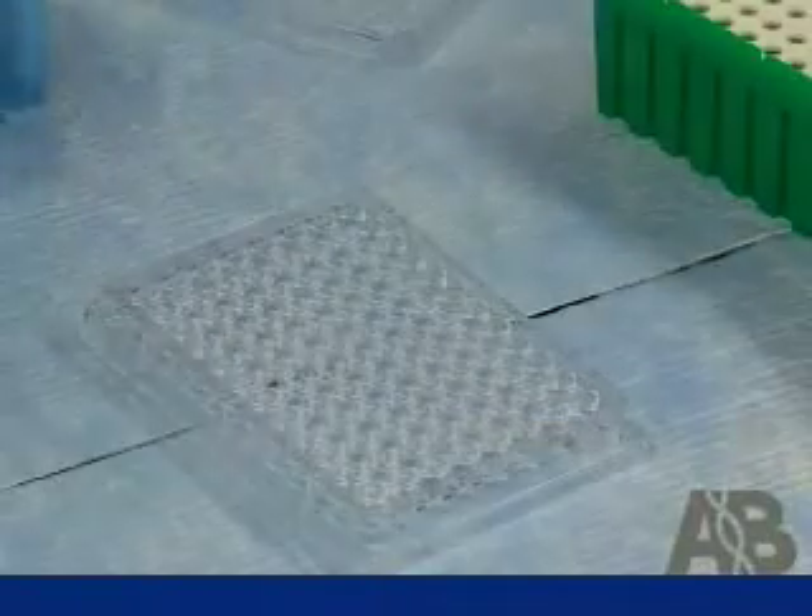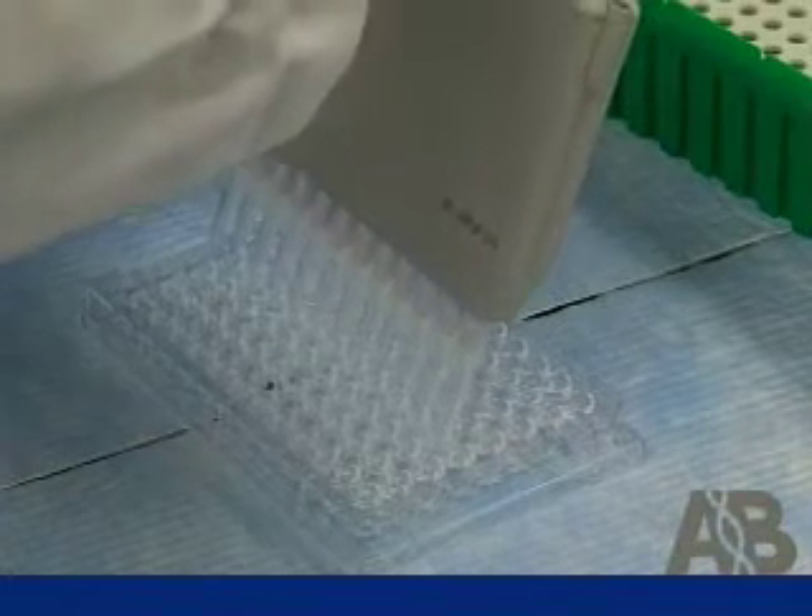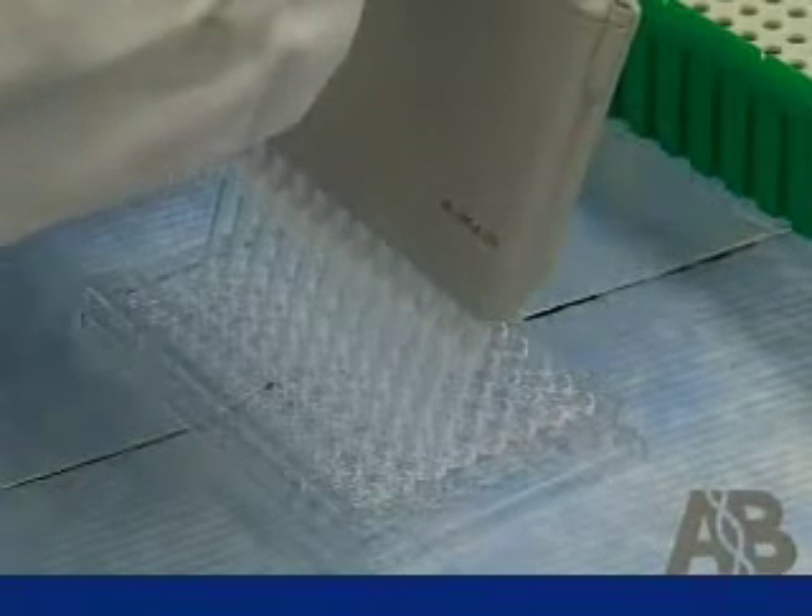I could process 96 samples using the Cells-to-CT kit, and in the 30 or 60 minutes it would take to do 12 samples, I could process hundreds of samples using the Cells-to-CT kit.